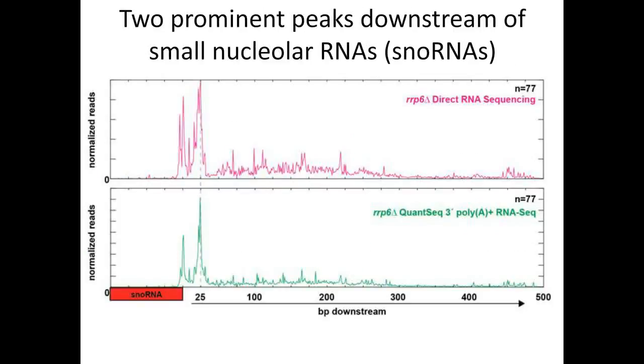So if we look at the snoRNAs, these small nucleolar RNAs, which as a class of genes represented a large fraction of the cellular poly-A plus RNA after nuclear exosome inactivation, we can see as a class with the meta-analysis two prominent peaks. What the meta-analysis does here is take individually each of the 77 snoRNA genes and normalize the total sequencing signal in the region of these genes to the same arbitrary constant, and then we can sum them up. By looking at them all together, we can see trends that we might miss by looking at any individual snoRNA.